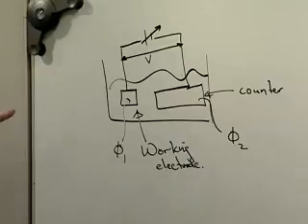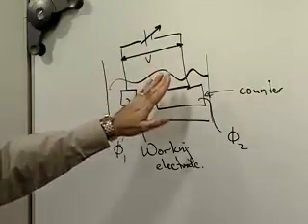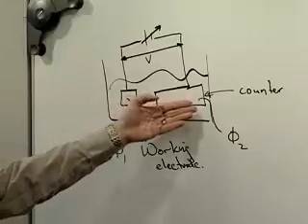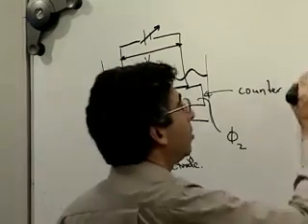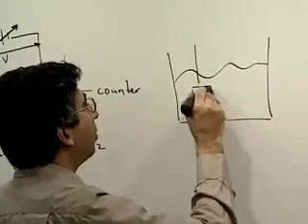Now, of course, for the situation I've drawn there, that is never going to happen because in order for the potential to distribute evenly around these 2 electrodes, the 2 electrodes have to be identical and the 2 interfaces have to be identical. And you can see I have a huge electrode over here and a small one over there. So I go back and I whip out my platinum again, and I cut some new electrodes. And I do the same thing, but now I have 2 identical electrodes.